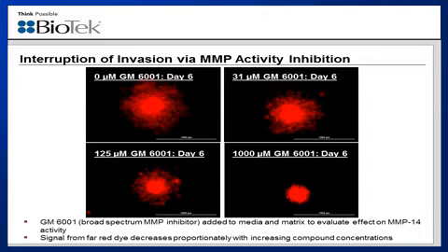The next step, once we confirmed that the assay was performing correctly and signal was indeed observed in the expected areas of the structure, was to add an MMP inhibitor to confirm that cleavage of the substrate was indeed from MMP activity and not from being in the presence of the components of the Matrigel matrix. Here we used GM6001, which is a broad-spectrum MMP inhibitor.